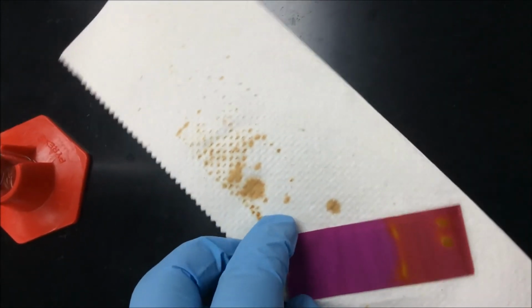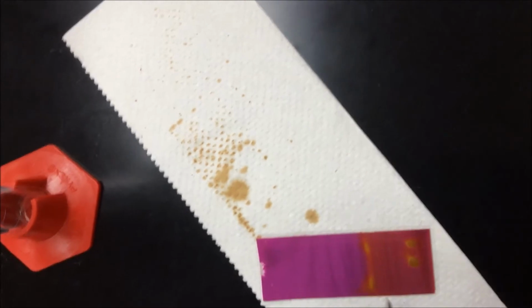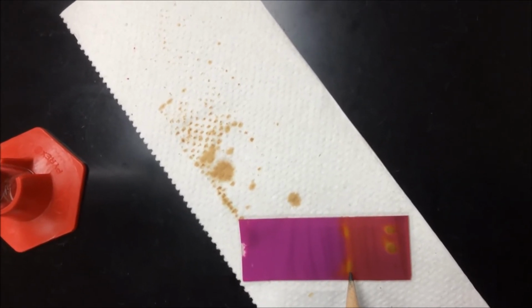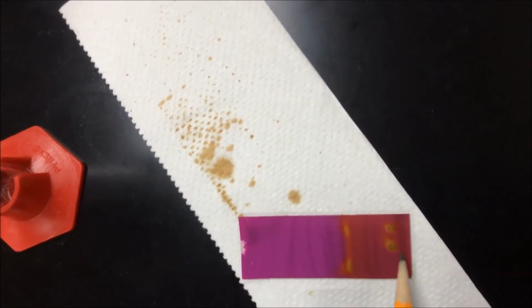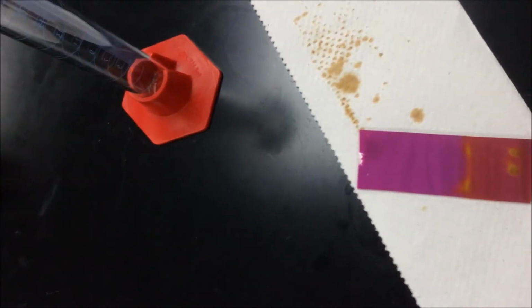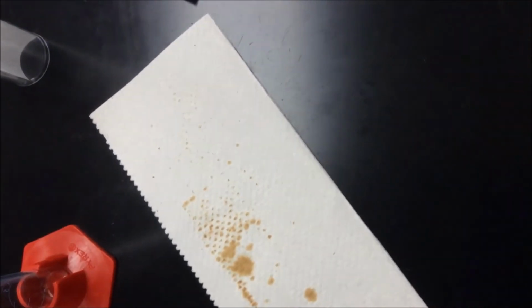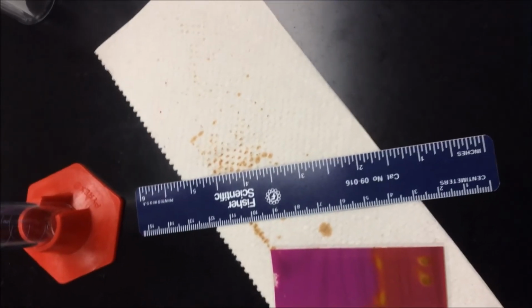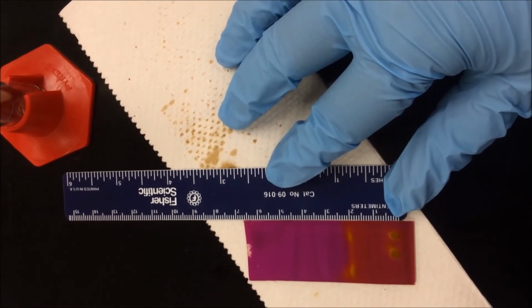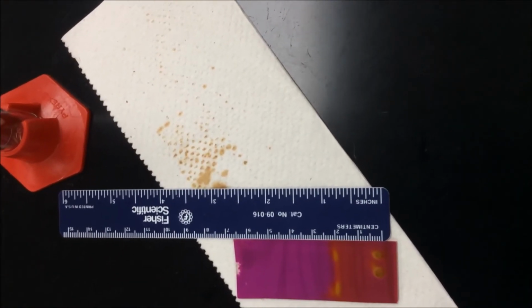Okay, so going back to this TLC, one thing that I would want to highlight is how you can calculate the RF. Again, you're going to essentially measure the distance from the origin to the central point of this spot, and you're going to divide that by the total distance that was traveled by the eluent. So in this particular case, let's take a ruler, and if I can set this right, the other way around. It's about 2.1 for the top spot, and the total distance that it ran was about 6.4.